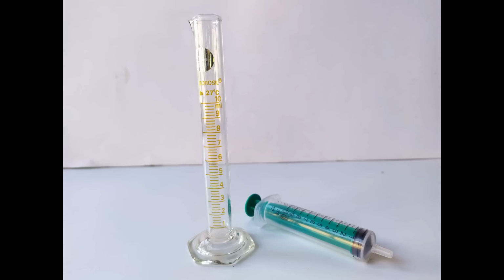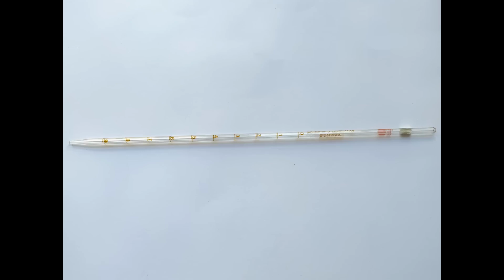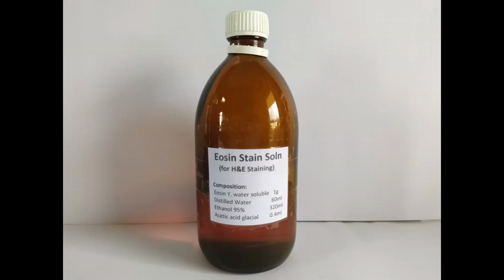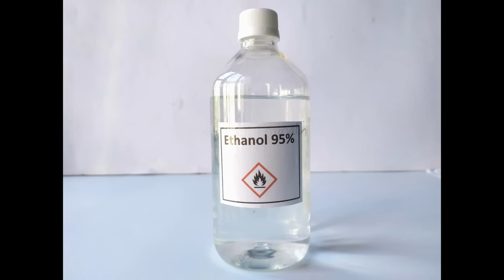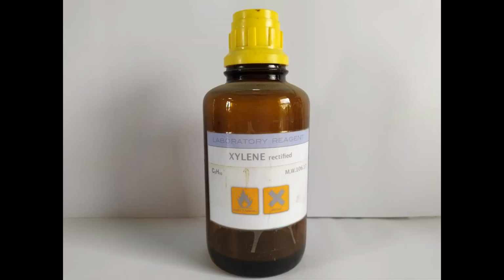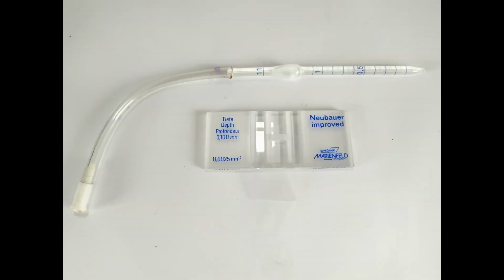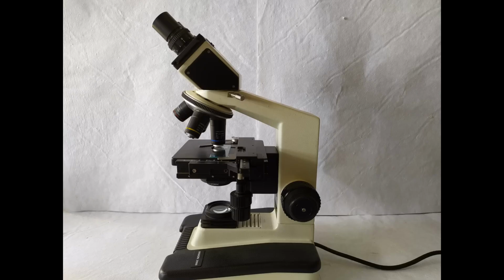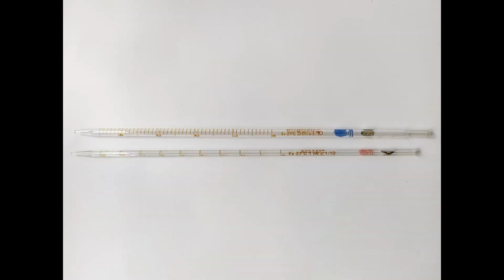For this experiment, you will need the following: freshly collected human semen sample, 10 ml graduated cylinder or syringe, pH paper, preferably narrow range, a narrow glass tube or pipette, droppers, glass slides and cover slips, eosin and nigrosin stain solutions, Harris hematoxylin stain, eosin stain, 1% acid alcohol solution, alkaline water or 0.2% ammonia water, 95% ethanol, absolute ethanol, xylene, DPX or Canada balsam, Coplin jars, thumb forceps and pins, hemocytometer counting chamber with WBC pipette, semen diluting fluid, compound light microscope, immersion oil, Seliwanoff's reagent, test tube and holder, spirit lamp, 5 ml and 1 ml measuring pipettes.